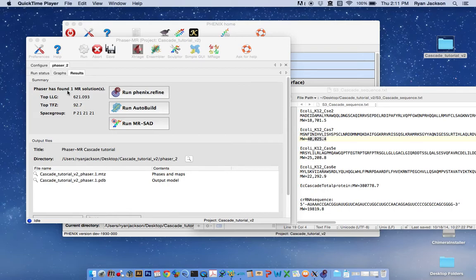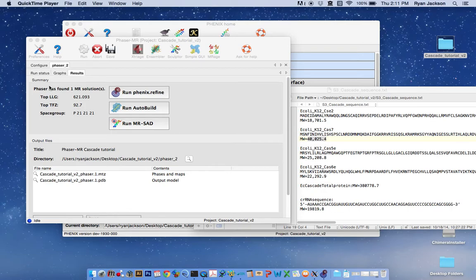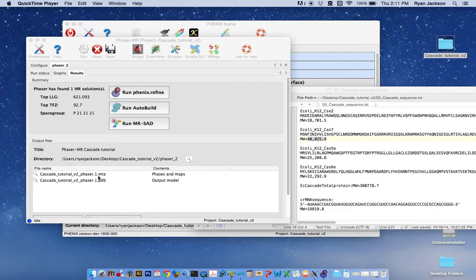For some problems, something that has internal symmetry, like the proteasome, you may expect to have more than one solution because of the symmetry in the protein. But it looks like we have a very nice solution here with cascade and it has given us an output file right here as an MTZ and a PDB that we could look at in coot.